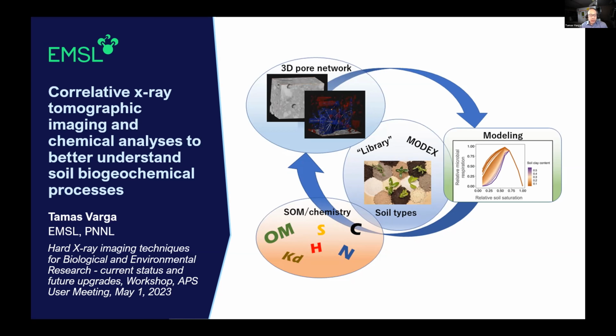It's a hydraulically saturated column experiment where we saturate the columns with synthetic soil water and maximize residence time to make sure that we can extract all the water exchangeable or water extractable organic matter, by doing a series of these stop flow runs. And then in the end we also have the non-exchangeable, or immobile, organic matter in the soil.